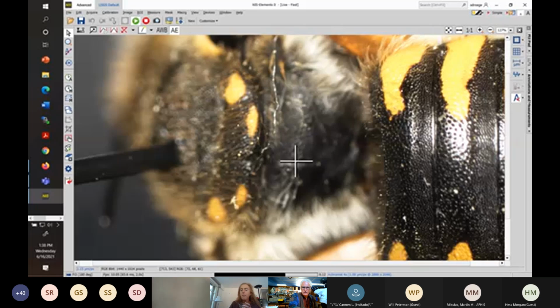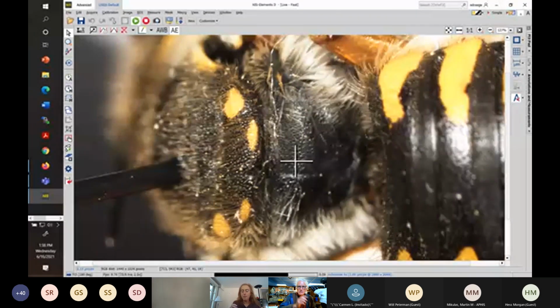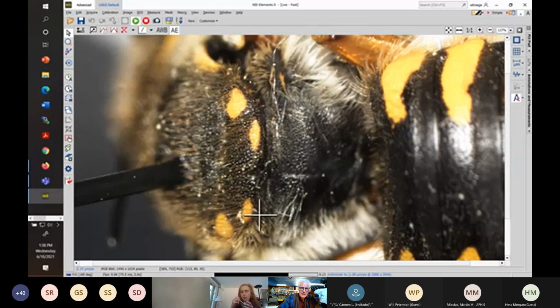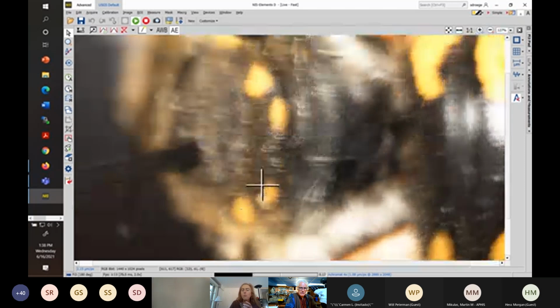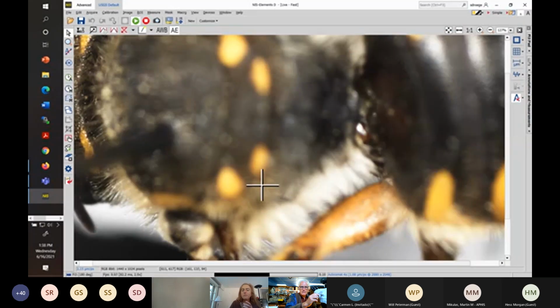You can see this has markings that are similar in color and general patterns to Anthidiellum, but here's the scutellum again back here, and you see things that are kind of bumped out. This is where people get confused. Like, is that the lamellate shelf that people are talking about? If you have never seen that, it gets confusing.